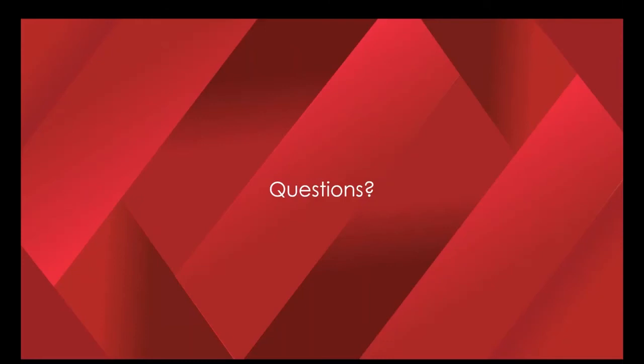That's a really interesting application, but at the moment our DIC software is only able to take images from our video extensometer. Again, our intent is to basically make it easier by integrating it with the test system. So if we need to do something more complicated or more powerful than that, we've partnered with a company called LaVision, and they can pretty much do anything we've ever needed to do. So I would recommend reaching out to LaVision, who creates DIC equipment and software, for anything more complicated.